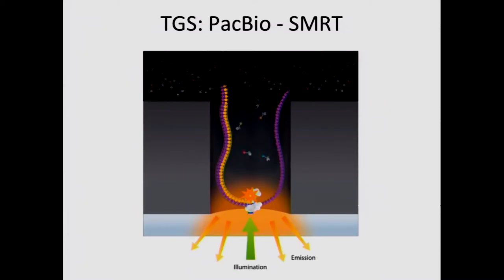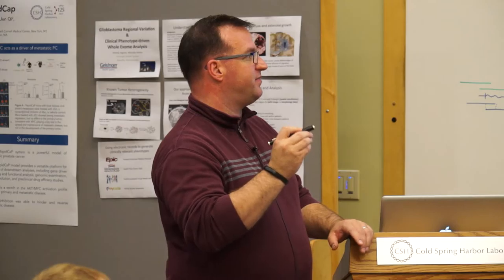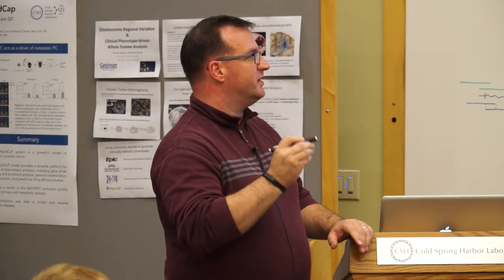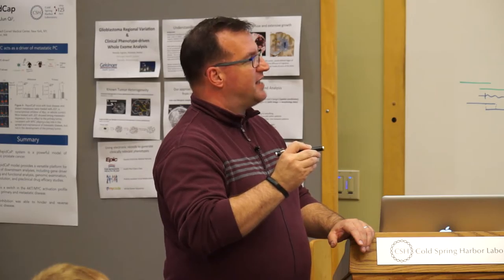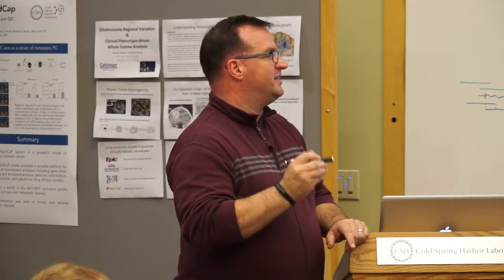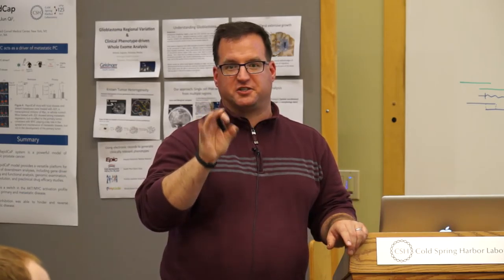And in a nutshell, and again, this is going to be a little bit superficial in the interest of time, what the PacBio machine does is it has hundreds of thousands of nanopore wells, and at the bottom of each well is bound, physically fixed, a very special polymerase, a polymerase that has been dumbed down. This polymerase is just really slow, and its incorporation rate is really slow, such that if there's a template molecule that happened to get bound by it, stuck to this pore, as this polymerase processes the molecule, it does so in such a slow way that if you're looking close enough, as each base gets incorporated, there can be a little flash of light that you can pick up on a video camera.